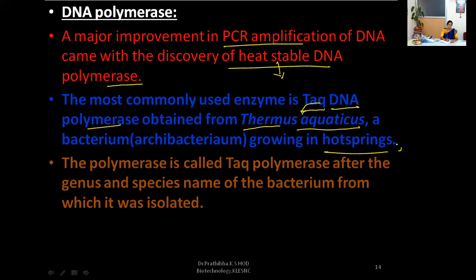From this bacterium, the Taq DNA polymerase enzyme was isolated. This enzyme can withstand temperatures above 95 degrees Celsius.